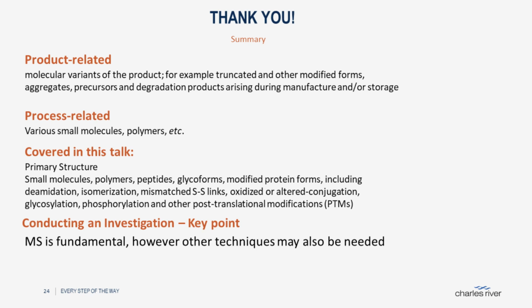Great, thanks, Andrew. So the first question is, how is dual detection more advantageous to inline UV and fluorescence detectors that are upstream of the mass spec? Okay, let's see. So upstream, so yeah, UV detectors usually can be run that way. What we've seen with fluorescence detectors is the flow cells sometimes cannot handle a lot of back pressure. So just something to keep in mind, but that is a good question. It's definitely possible to run them in line in that way. The only little caveat there is with the fluorescence cells that can sometimes burst if too much pressure is put on them.